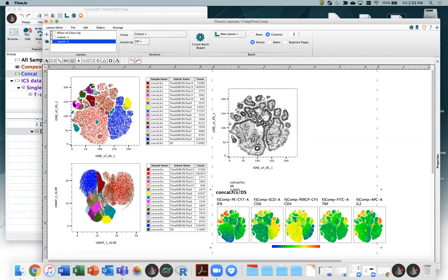So again, some of the more interesting populations are made to stand out a little bit more on t-SNE, whereas they kind of crush together on UMAP, indicating that they're different from, we're going to assume, this population here, the red, this broad thing, which is the middle of these and which is largely green for everything. These largely red cells in these two plots are all our negatives. And so we can see in UMAP that our negatives are much more different from everything else, and that this blue population stands out over here just because it's the CD8 version.